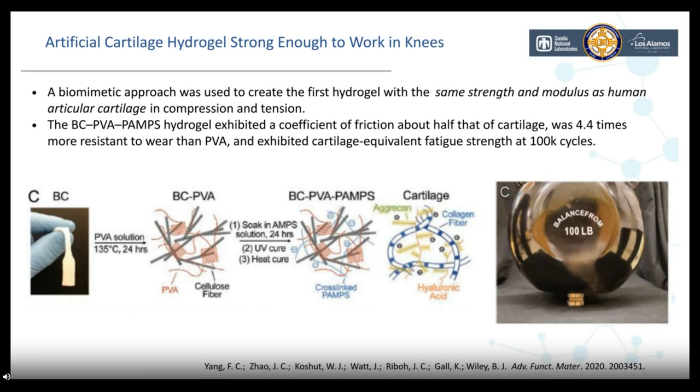CINT is a user facility, so some of the most exciting work that we do is with our users. So I'm just going to go over a few examples here of how the cryo suite and the LICA workflow have really impacted user science. The first example is with Professor Ben Wiley from Duke University.